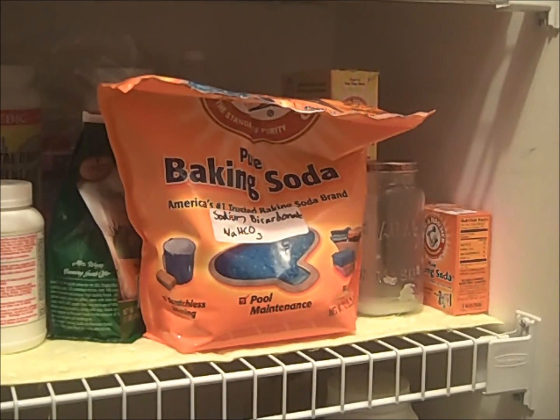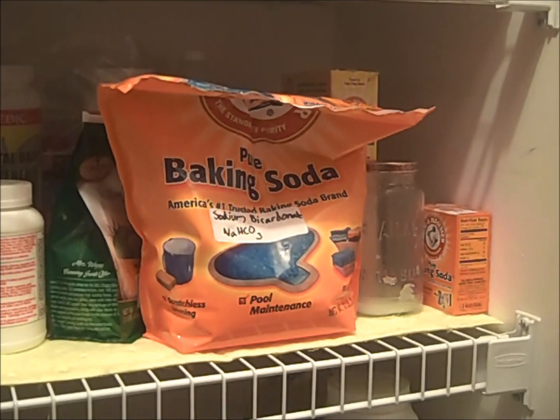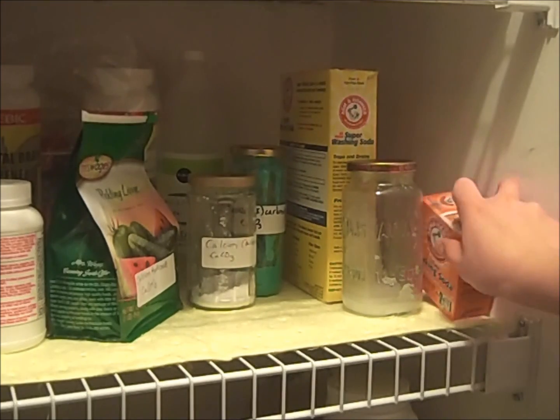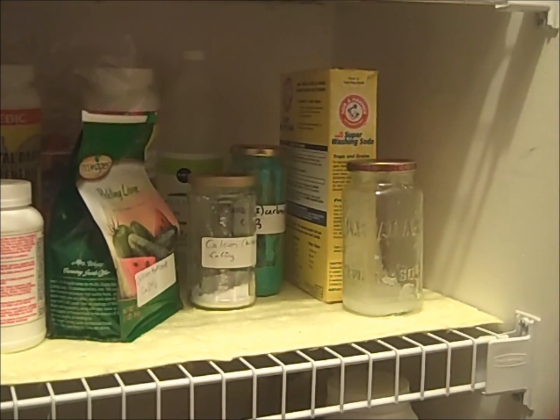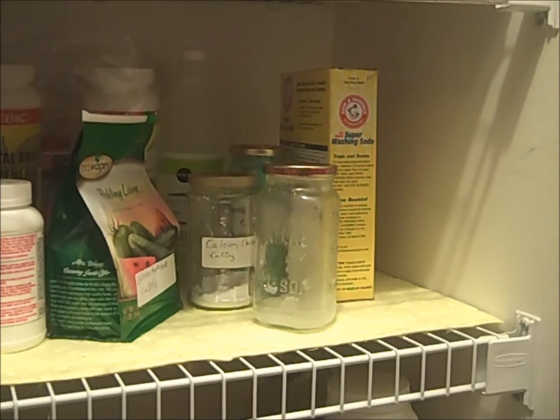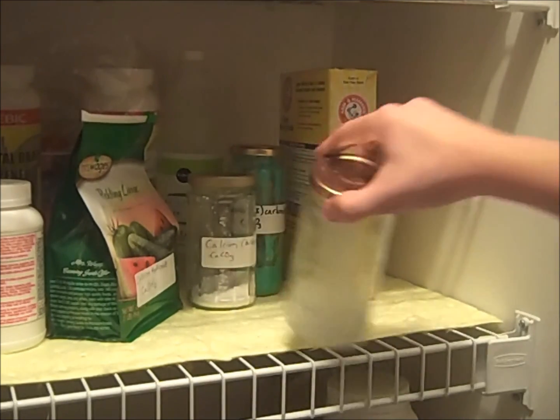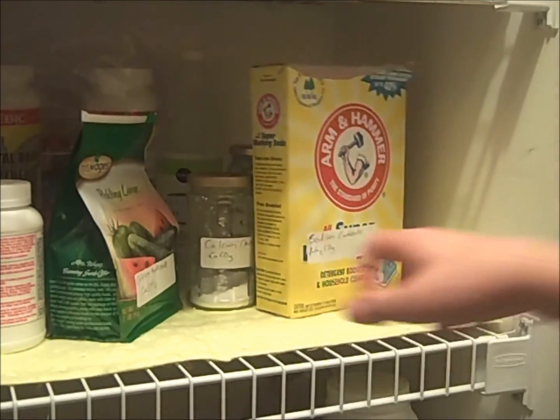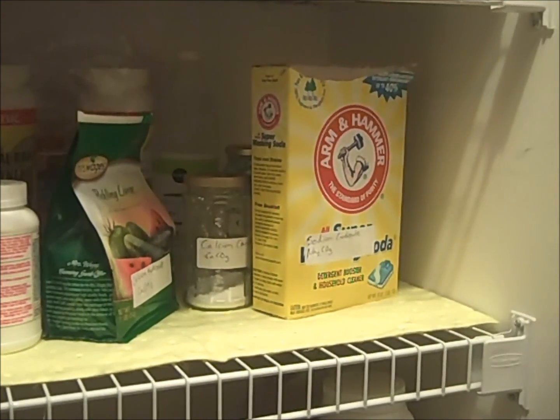Next we move on to bases. I store carbonates, bicarbonates, and hydroxides in ammonia here currently. We begin with baking soda, which is sold in very large sizes to increase alkalinity and pH in swimming pools, and also in small sizes for food use. This is potassium carbonate, which is very hygroscopic and is sold as a solution. It is a pH-raising chemical for spas. This is washing soda, which is similar to baking soda, although it is sodium carbonate instead of bicarbonate.